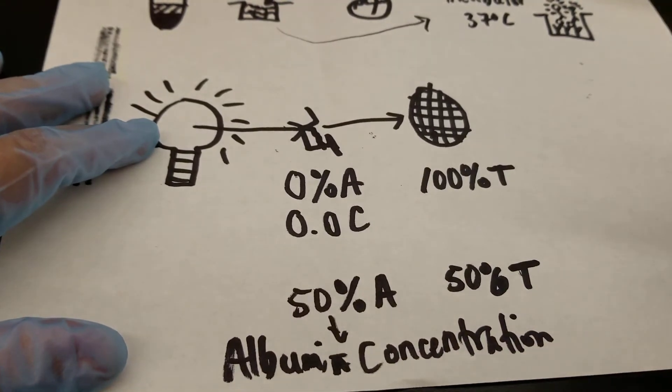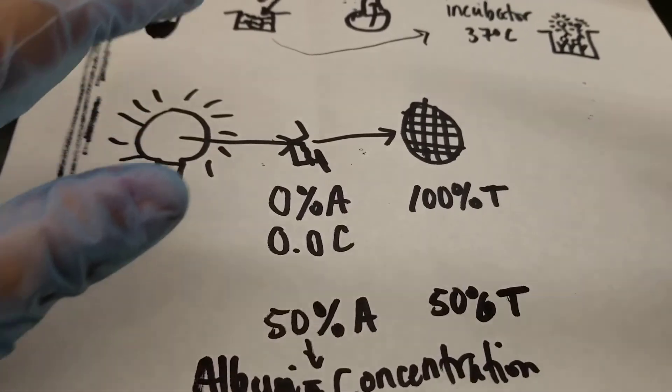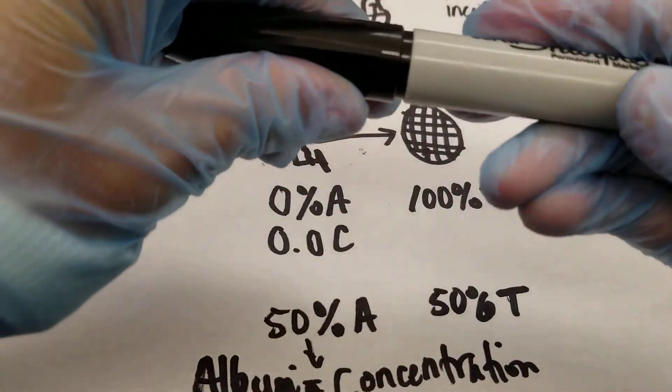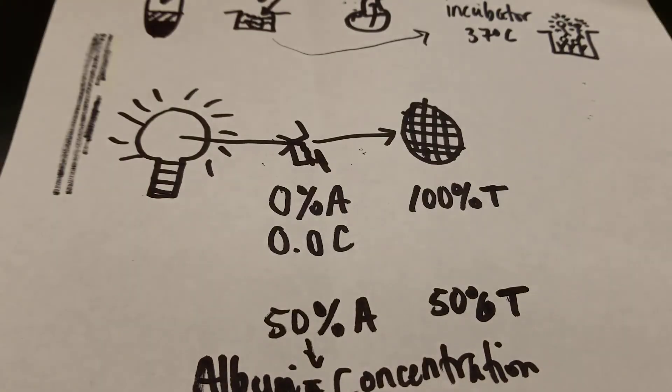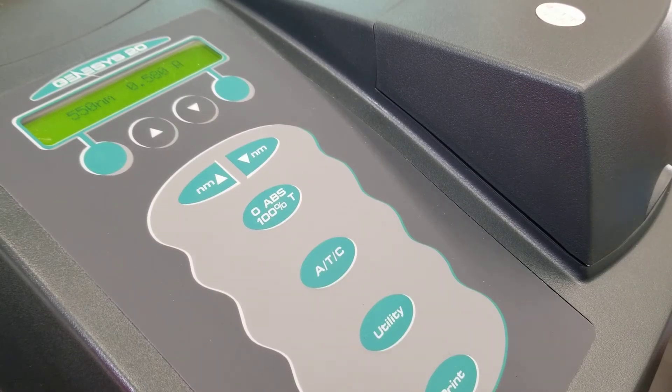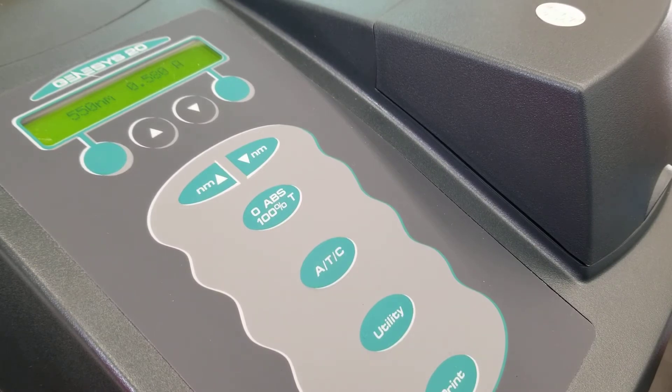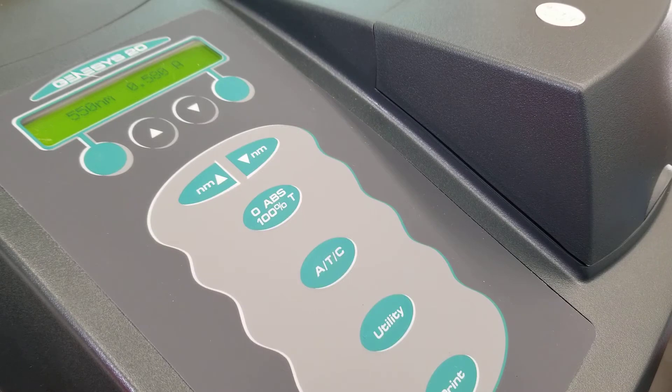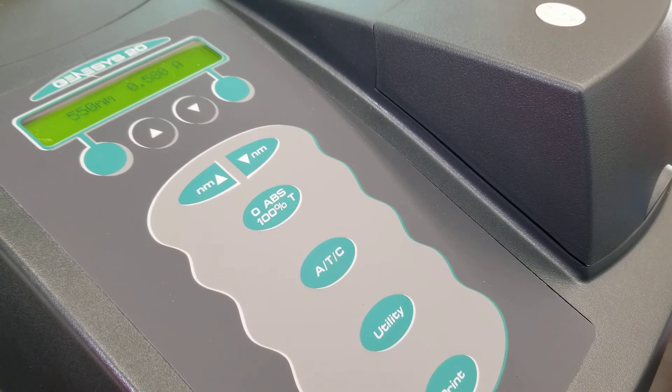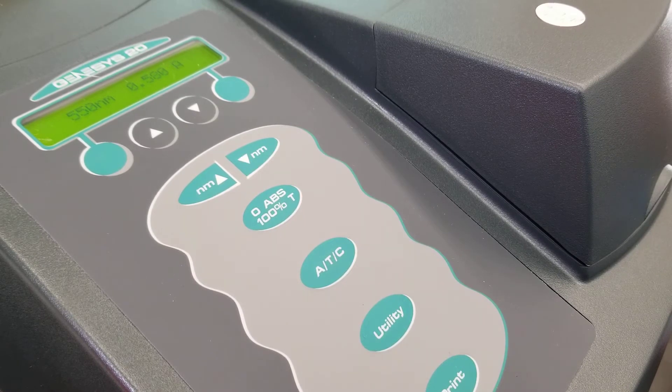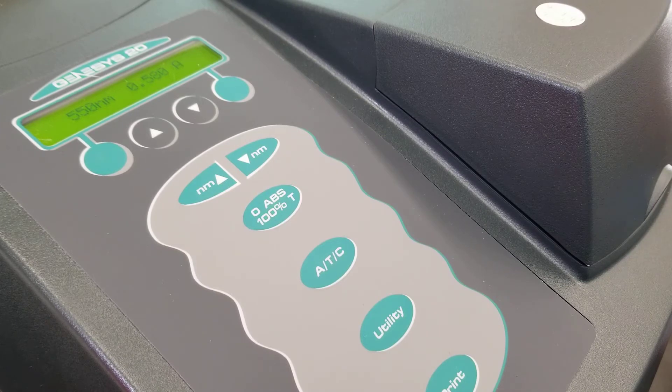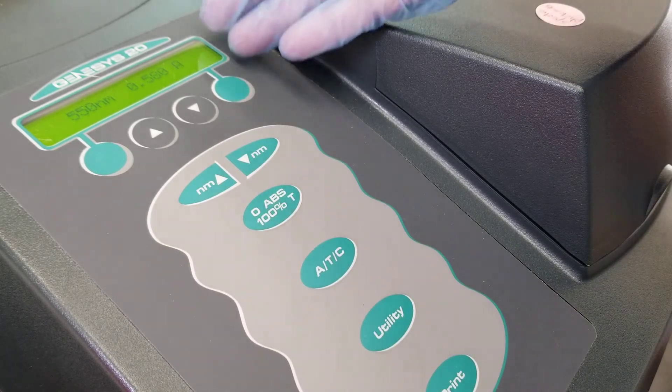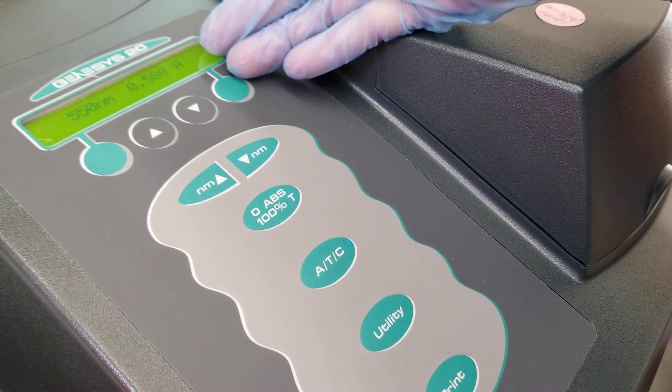So let's go to the spectrophotometer that we use in our classroom and talk about how we're going to do that in class. All right. So this is the Genesis 20. The first thing you want to do when you come into class is make sure to turn it on because it takes 15 minutes to warm up. You'll have to remove the cover and turn it on and then wait 15 minutes. So make sure you do that first.